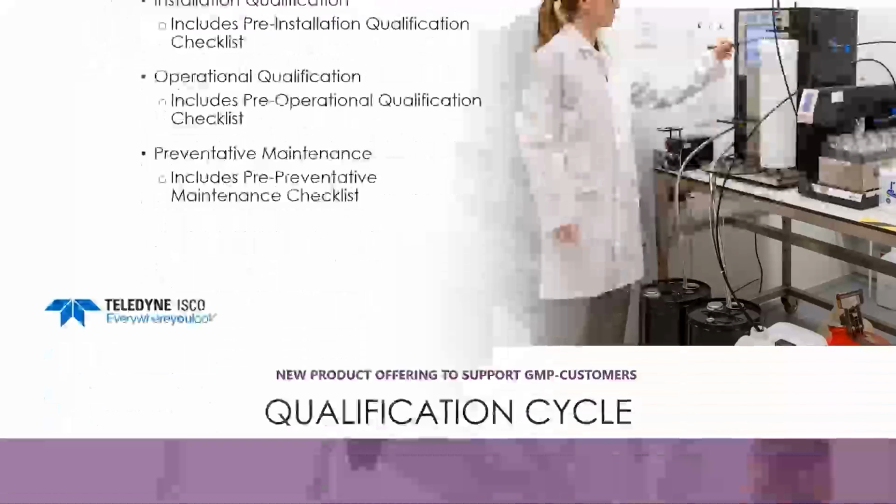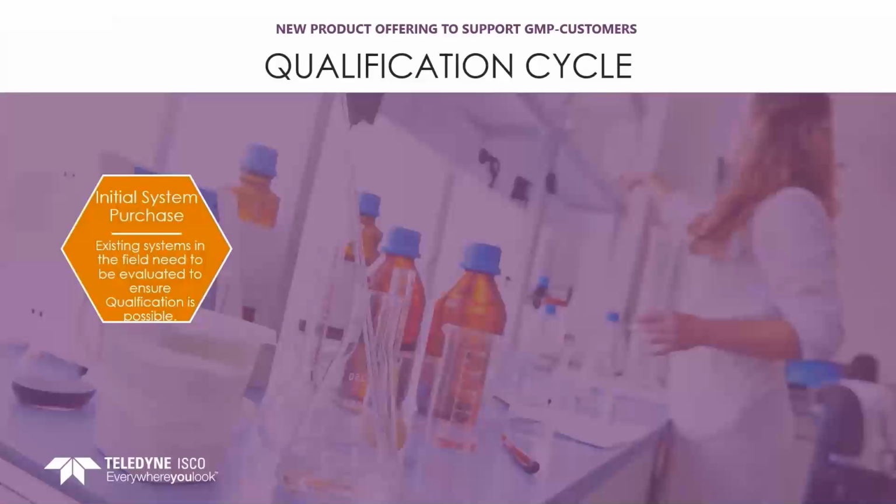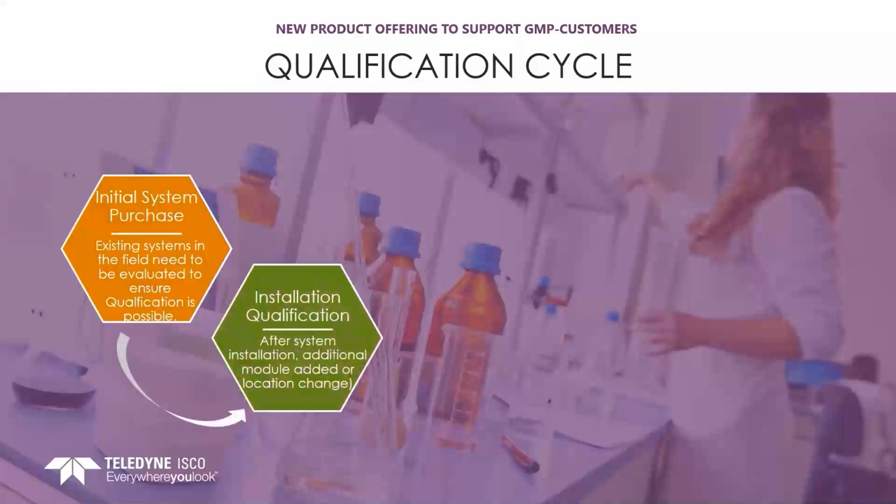To understand the qualification cycle here, as you have the initial system purchase or an existing system in the field, it needs to be evaluated to ensure that the system can be qualified or brought up to current standards so that it can be qualified. After installation, service would perform an installation qualification, and anytime an additional module is added to the system or location is changed on the system, you would also need to do that as well.